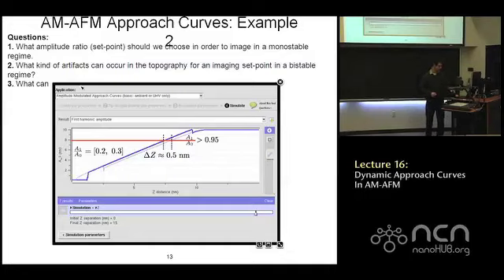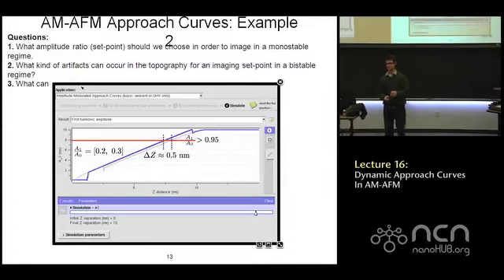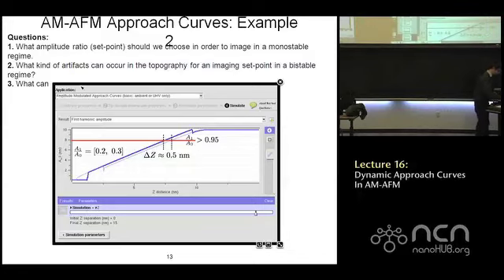But what we can do is drive the cantilever with a larger amplitude, okay? If you think about this, you're putting more energy into the oscillation of the cantilever, and it's going to be harder for the same attractive forces to reduce the amplitude. So what will happen is, and I left that simulation, so we'll just do it here in this case.